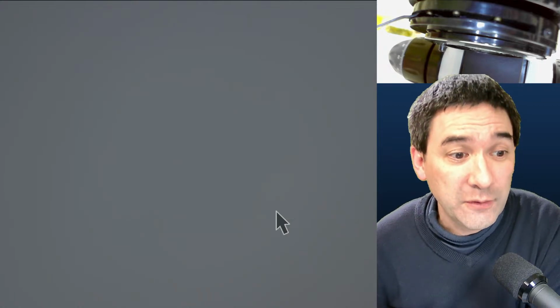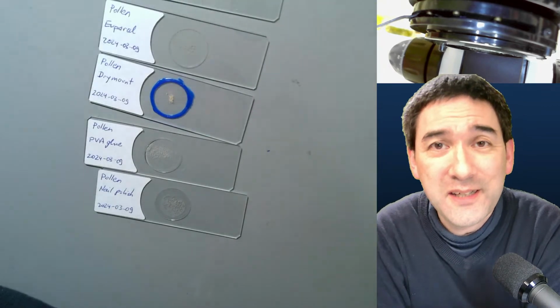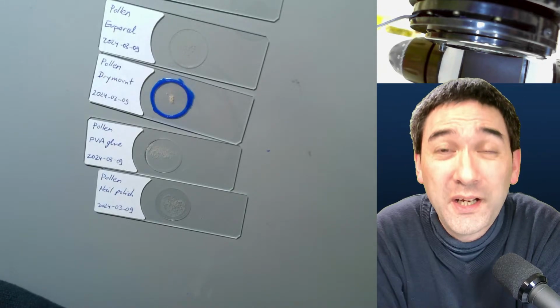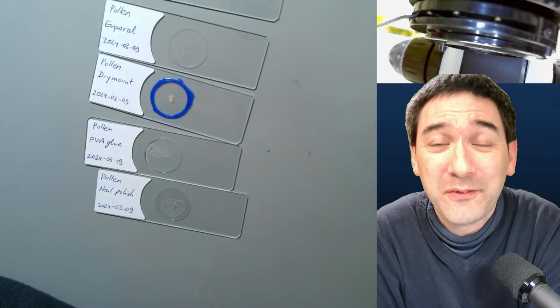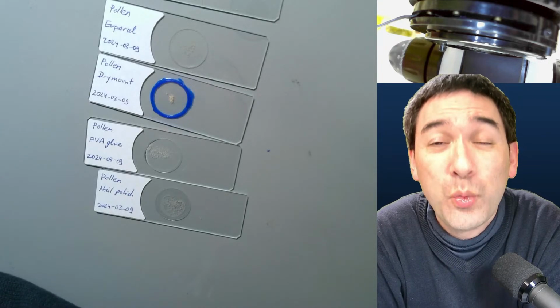I have to tell you the following: when planning this session today, I was thinking, okay, what could I talk about? Over 1.5 to 2 weeks ago, I actually started to make an enrichment culture for Paramecia. So I've got several water samples, and I dropped a small wheat grain in.